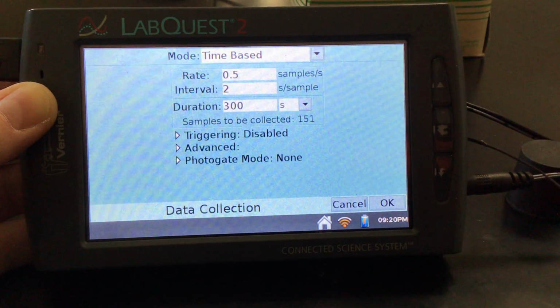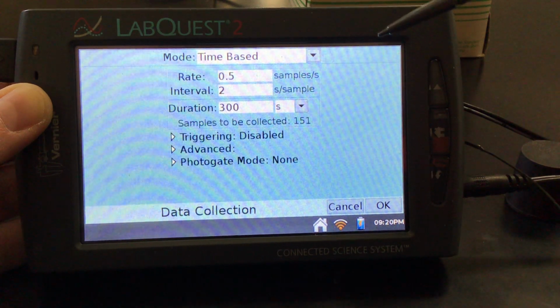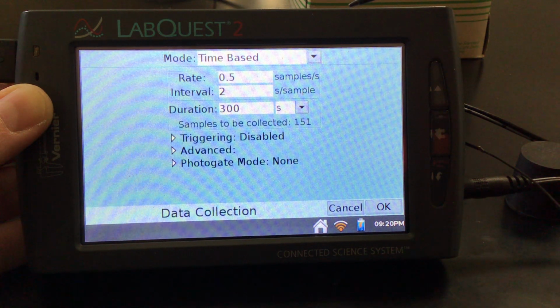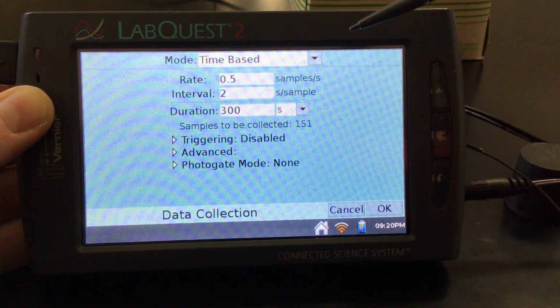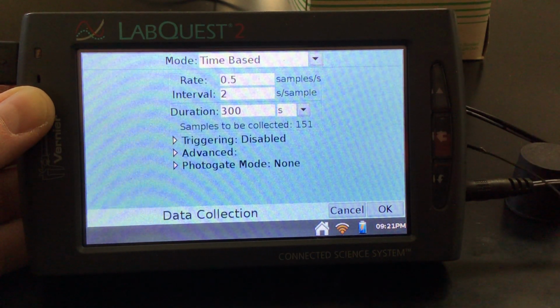Now we want to go to time-based. So what we want to do is collect our data. We're going to take our sample that we just got our wavelength from, the stuff in the cuvette that we used to find the peak wavelength we were going to collect our absorbance at, and pour that back into our original container. Then you're going to use 2 milliliters of just regular old bleach. You're going to pour the bleach in there, and you're going to let it react.